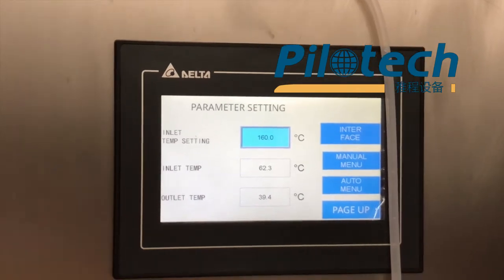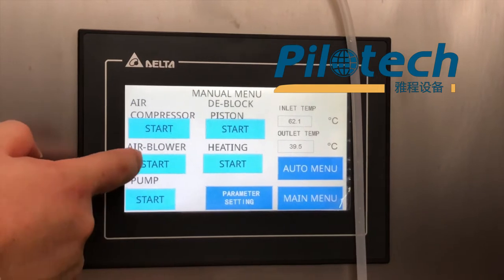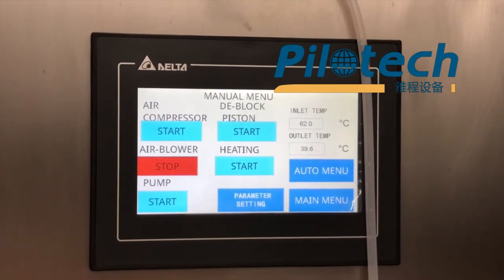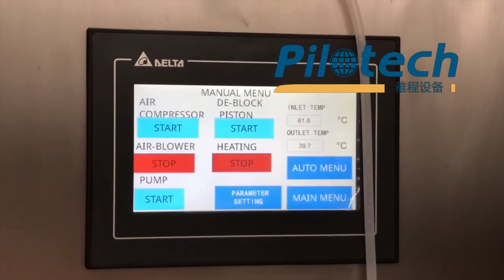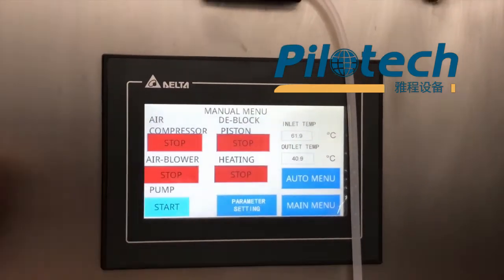Then click manual menu. First, start the air blower. Start heating. Air compressor start. D-block piston start.